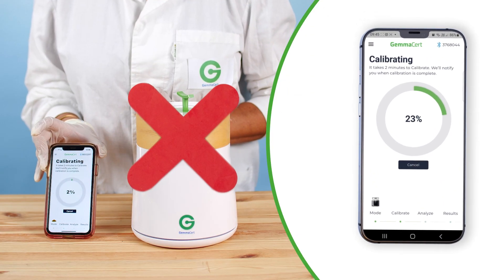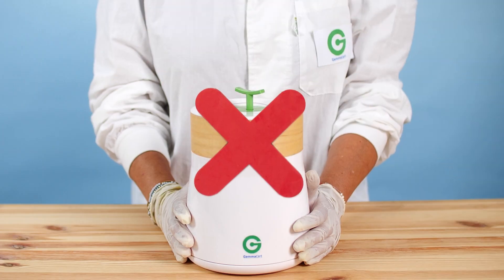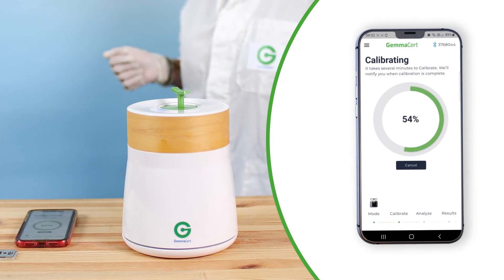Do not open the drawer during calibration. Do not touch the device or move it. Calibration will take a few minutes.